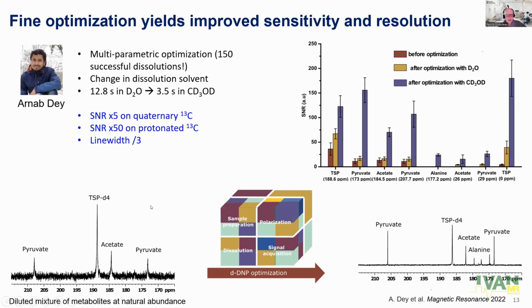As you can see here, he was able to significantly improve the sensitivity of our setting. This optimization, which was really very detailed analytical chemistry work, was key to obtaining a sensitivity that made it possible for us to tackle more real and more complex applications on biofluids.